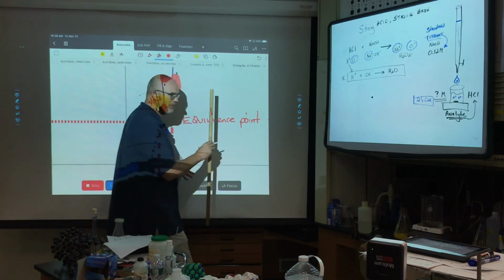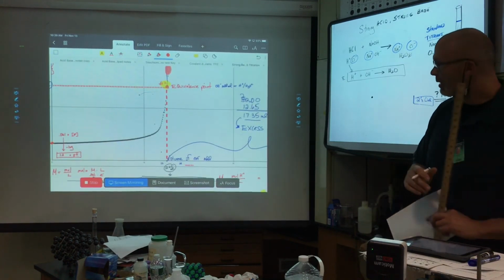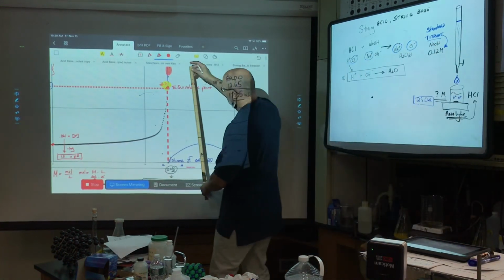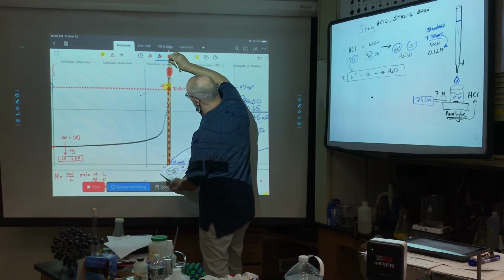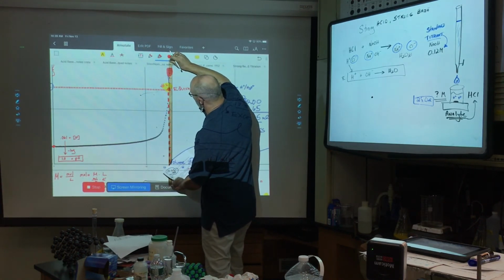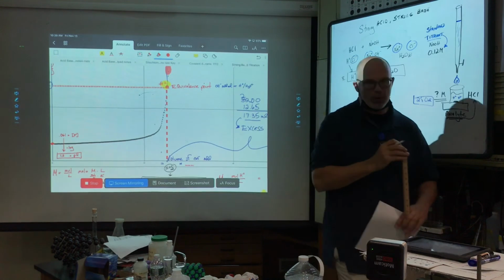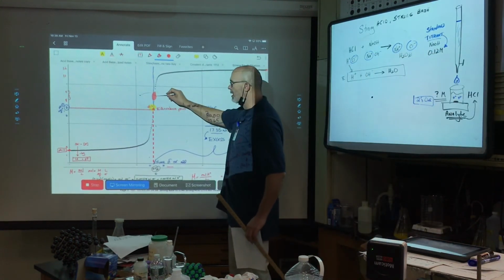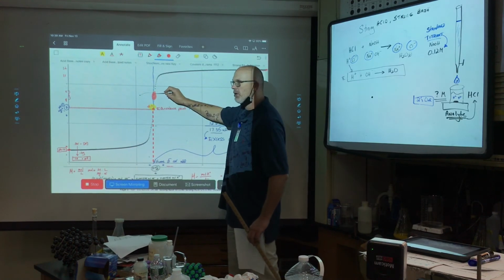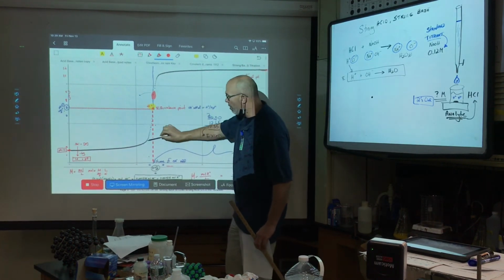I blew this up, but if you go back to where you were measuring this graphically, the difference of the ruler at the equivalence point to get the volume, and the difference at where we have a color change of a pH, isn't significant. You're going to get a very good approximation with an indicator, as long as the color change of the indicator is on the asymptote. And that's key, because they won't always have these large asymptotes.